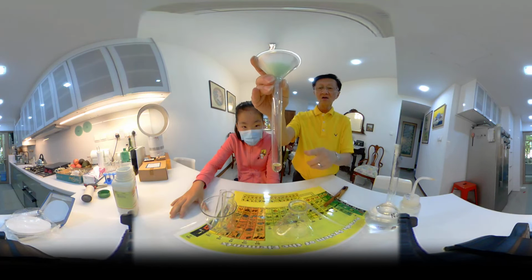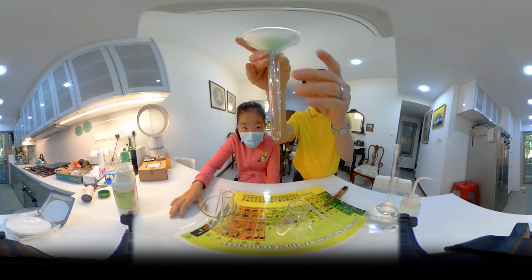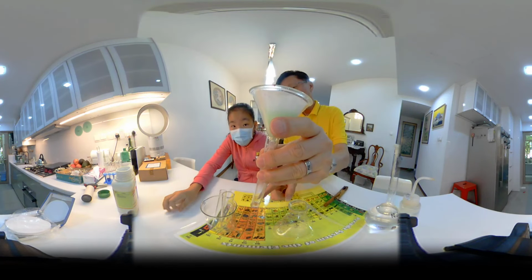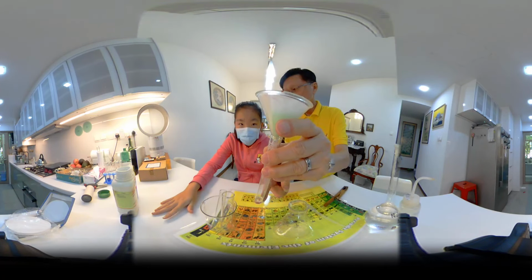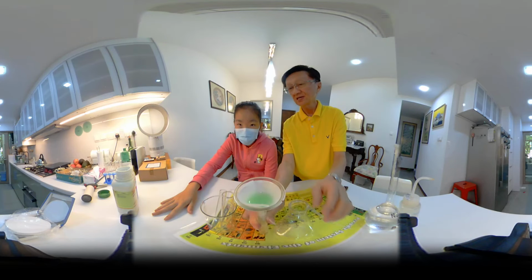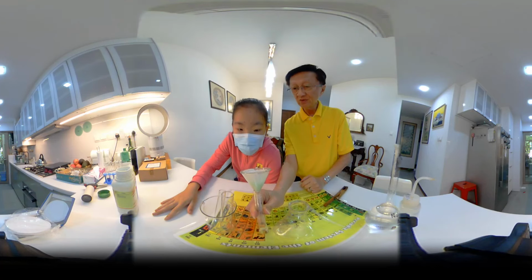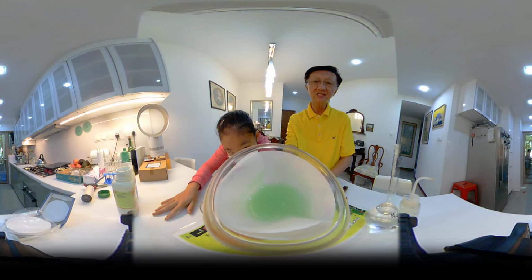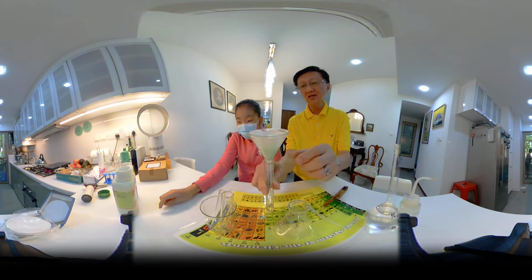Now the color of the solution is colorless, almost colorless, which means that the nickel ions are no more here. They are here at the PPT. Can you see the green PPT here? Yeah. Let the camera see the green PPT stuck on the filter paper.